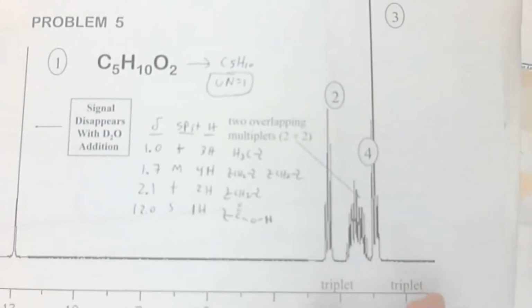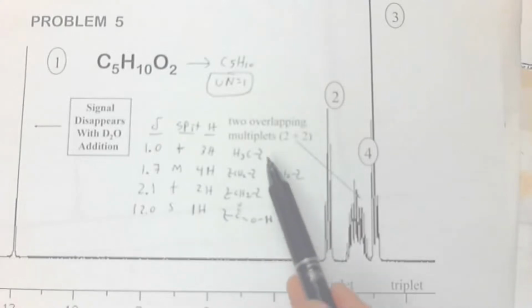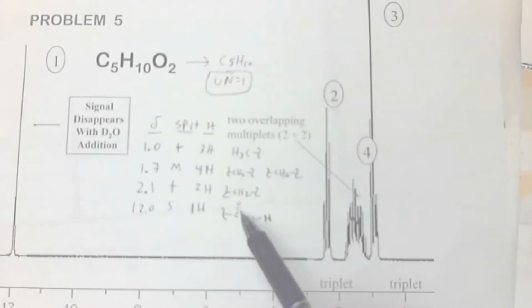Okay. Now with basically no thought at all, we know what the answer is. Because you have 2 end pieces and 3 identical middle pieces. It's a long carboxylic acid. How many carbons total? 1, 2, 3, 4. It's a 5-carbon carboxylic acid, right? It's a pentanoic acid.